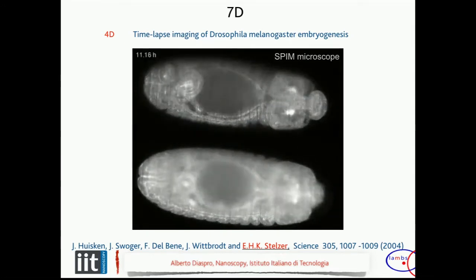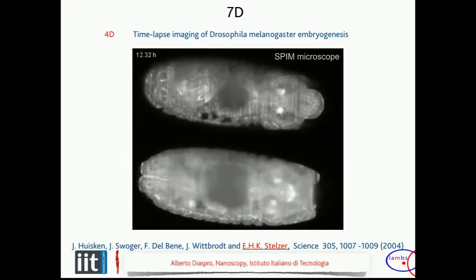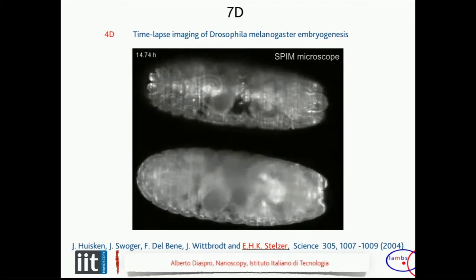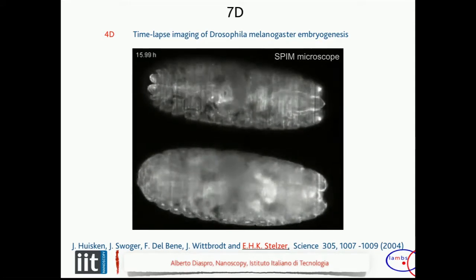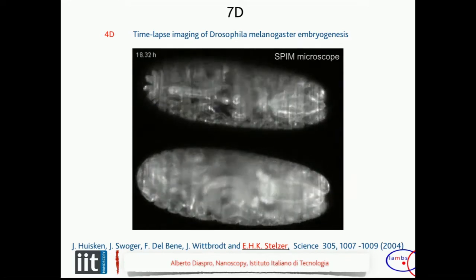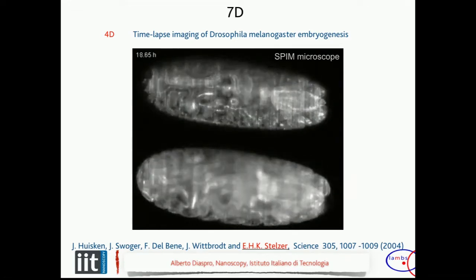And when you use fluorescence, especially in a special way, you can really track what's going on in your living system. And so you can better understand not only a normal or a pathological state, but you can also understand which is the effect of a pharmacological, for example, effect or a surgical effect in real time.